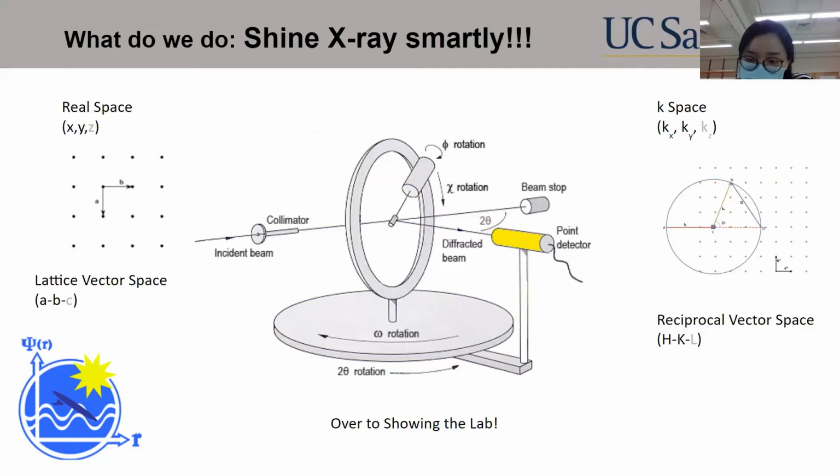And is that showing you just what materials it's composed of, or is that showing you properties of the material and the crystals it forms? That's a good question. So it's not going to show me that. It's going to show me how the repetitions are. So in other words, the rule of the land.